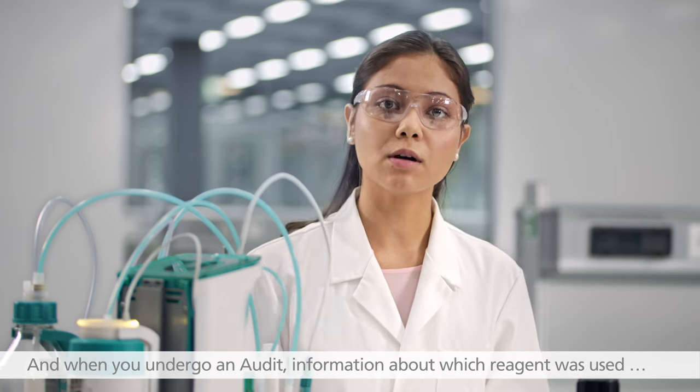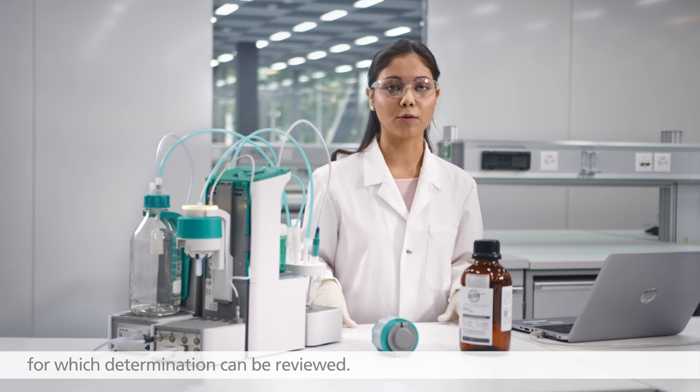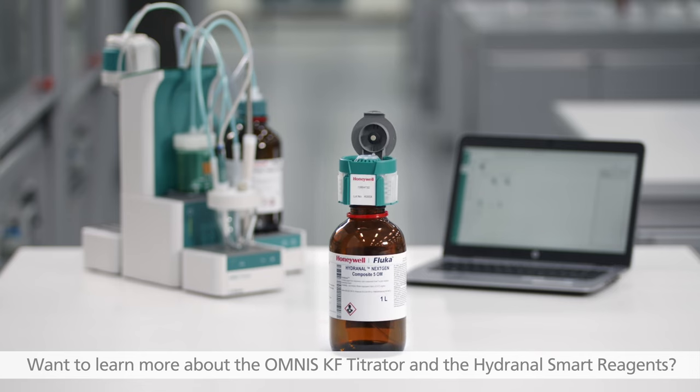And when you undergo an audit, information about which reagent was used for which determination can be reviewed. Want to learn more about the Omnis Karl Fischer Titrator and the Hydranal Smart Reagents? Call your Metrohm sales rep now.